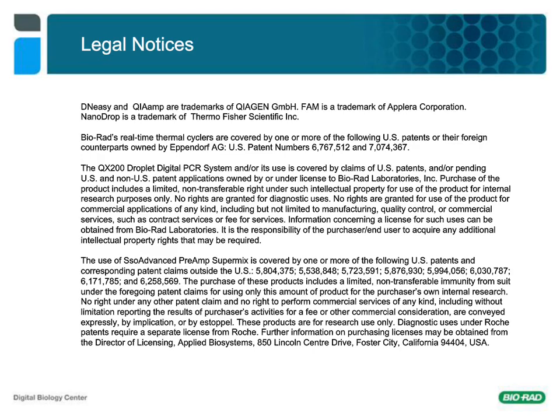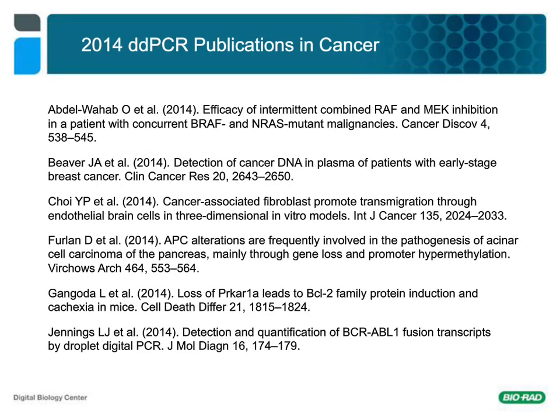Our first question is, can ddPCR be used for DNA methylation discrimination, especially in cell-free DNA? Absolutely. Last year I submitted a poster to, I believe, AACR.